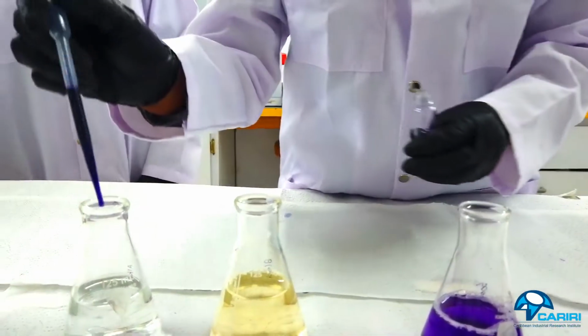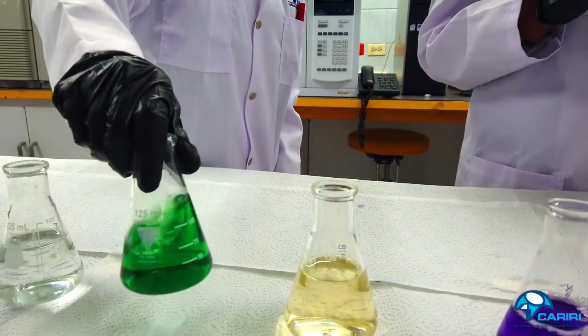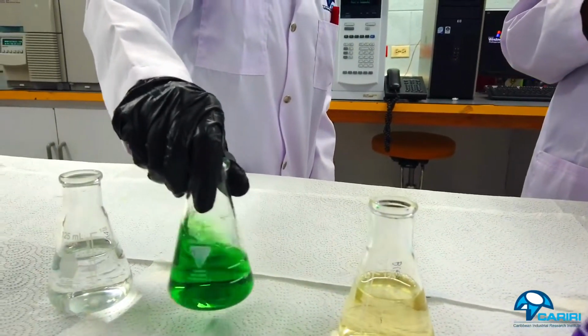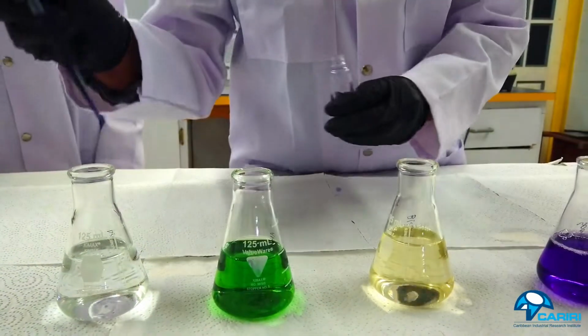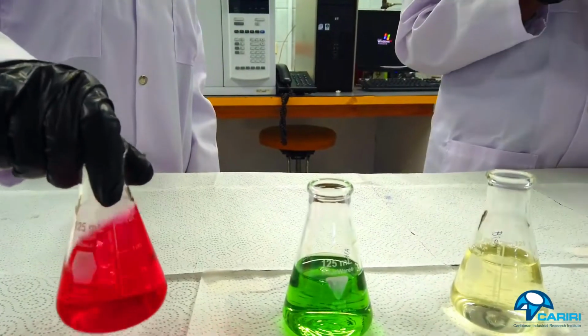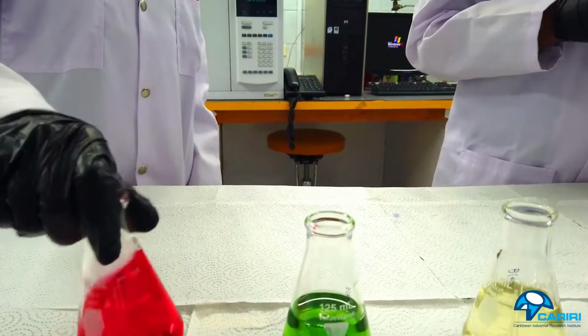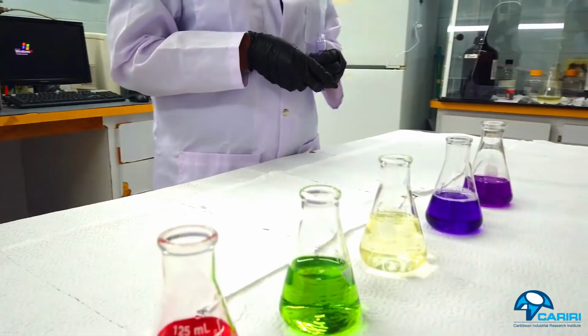Now to the fourth one. Wow, so we have a lovely green color there. And our fifth flask, very intense red.